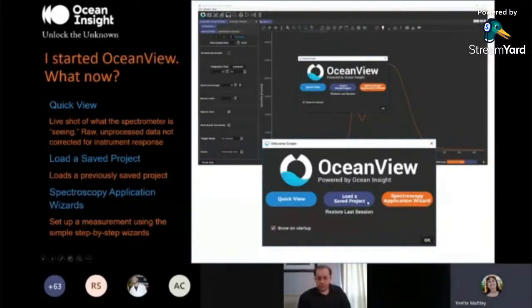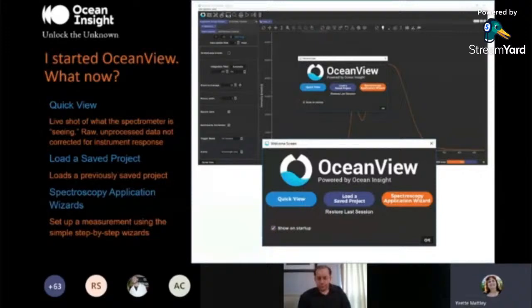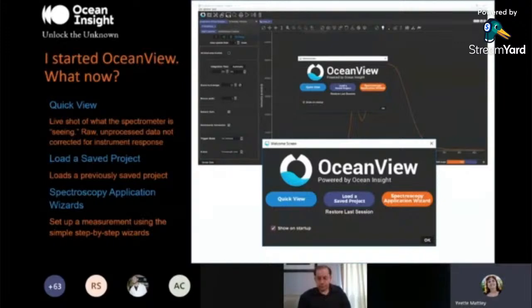QuickView is what we used to call scope mode — it's a live shot of what the spectrometer is seeing, raw unprocessed data not corrected for instrument response. Think of QuickView as a diagnostic mode: it helps you set acquisition parameters so you're not saturating. The second option is to load a saved project — you can customize and create amazing OceanView projects and reload them from the welcome screen. The third option — where most people will go first — is the spectroscopy application wizards, which walk you step-by-step through getting into a processed mode like absorbance, reflection, or other modes. This welcome screen opens every time you start the software unless you remove the 'show on startup' option.